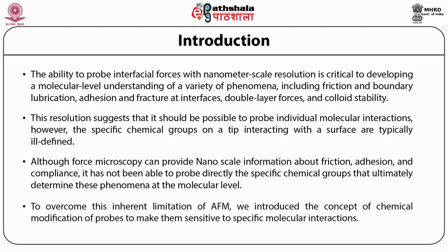To overcome this inherent limitation of AFM, we introduced the concept of chemical modification of probes to make them sensitive to specific molecular interactions.